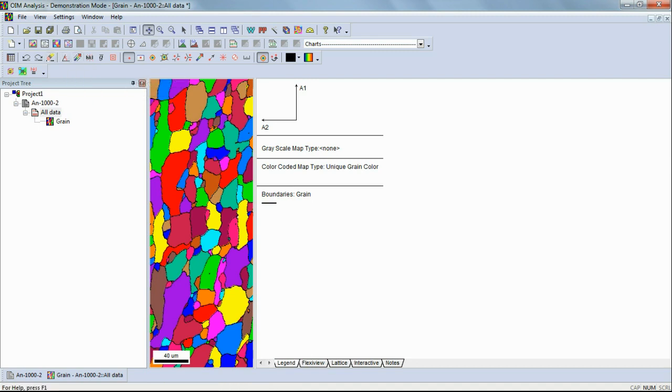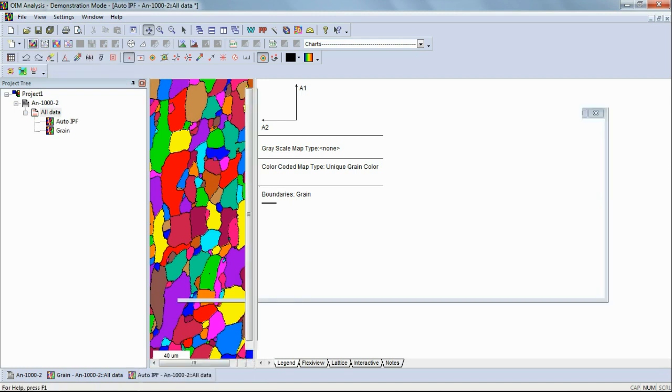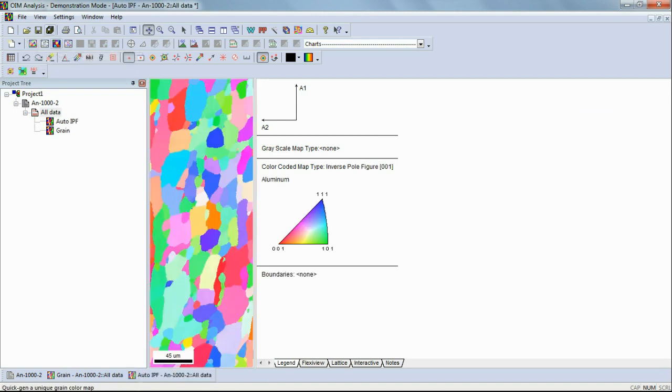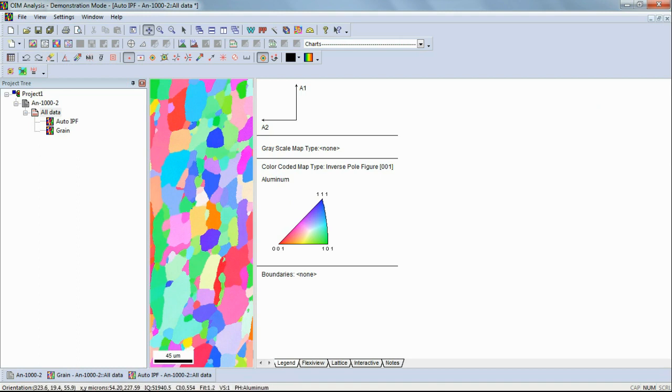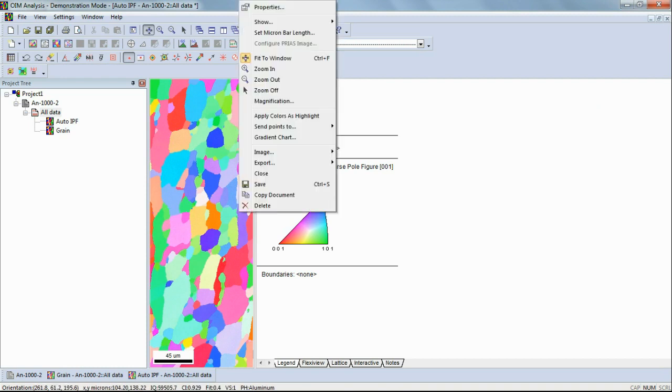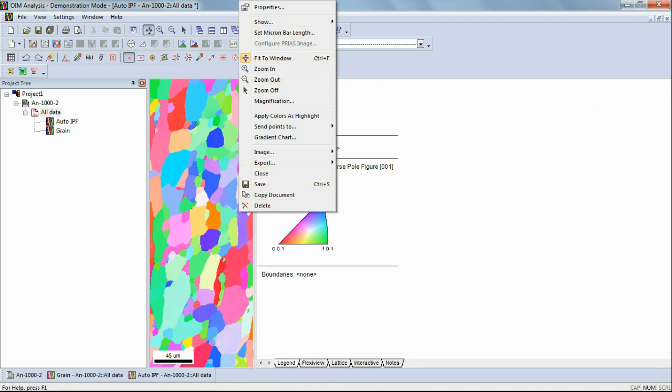Clicking on the IPF option can draw the grain orientation map. In this map, too, the boundaries of the grains can be shown with the angle of misorientation angle, thickness, and color. This map shows the orientation of the grains based on a default axis.